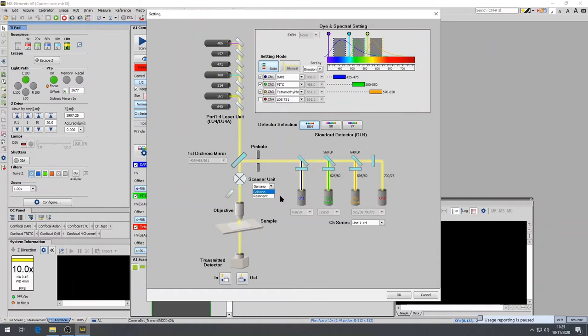This allows a flexible frame scan. And by increasing the pixel dwell time, it will reduce the scan speed and with it increase the returned fluorescence. Of note, it's important to remember that the longer pixel dwell time will increase the chance of sample bleaching.